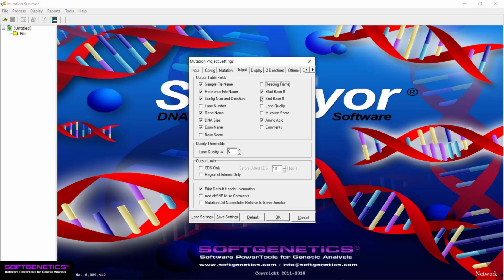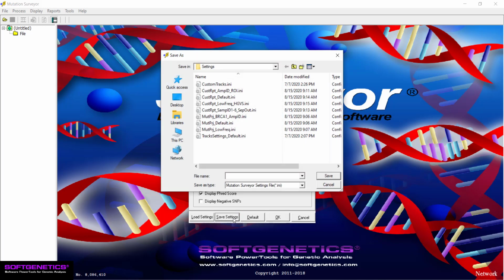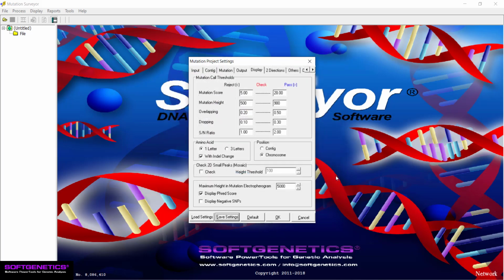Please view our introductory overview webinar for additional information on the available settings. When done, click the Save Settings button located at the bottom of the dialog. Set the location for where to save the file and enter a name for the configuration file. Please note that all configuration files are saved in the same .ini format, so it may be best to include the type of settings in the file name. Click Save to save the custom settings file. This process can be repeated for each type of project analysis needed.